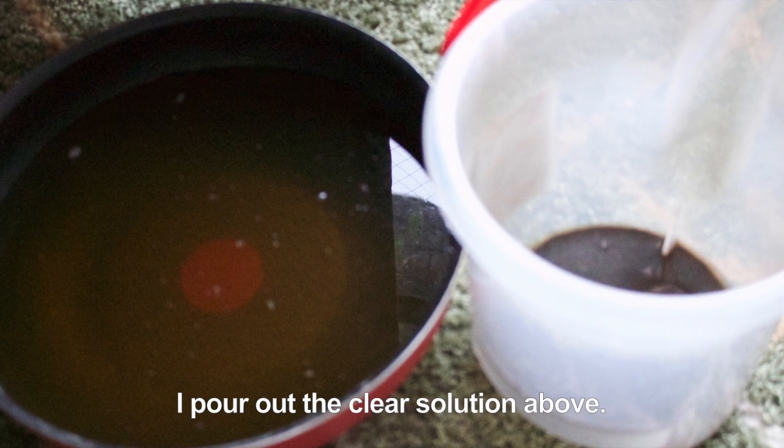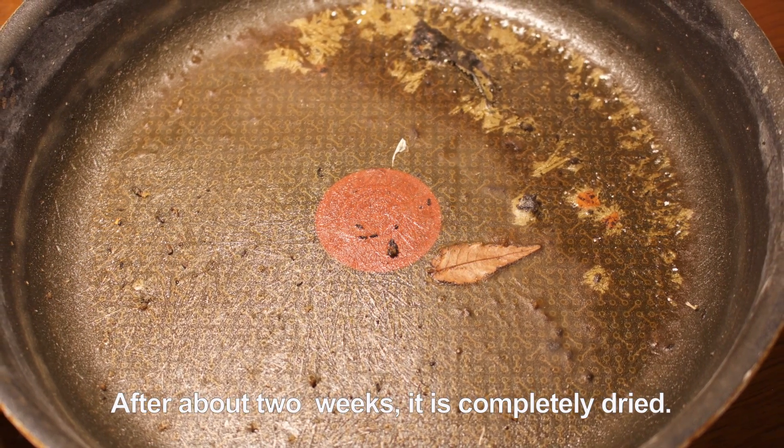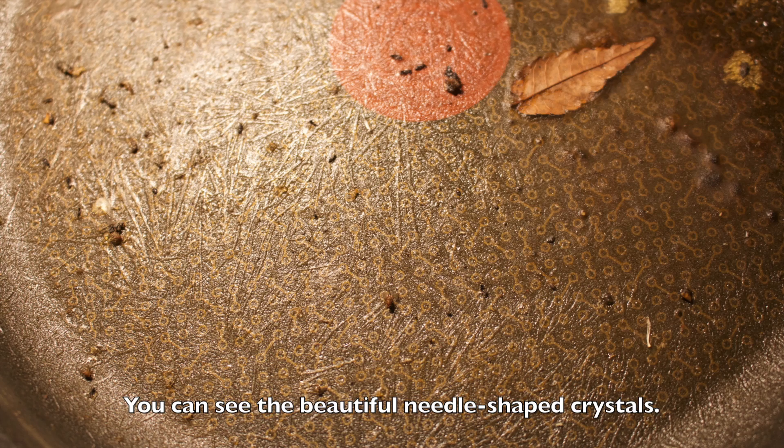I pour out the clear solution above. After about two weeks, it is completely dried. You can see the beautiful needle-shaped crystals.